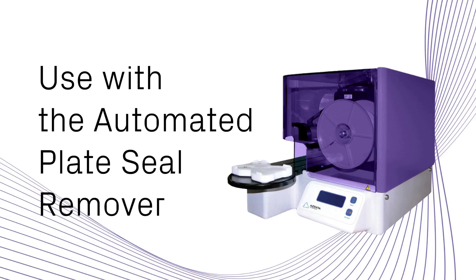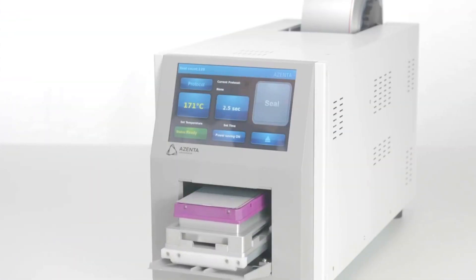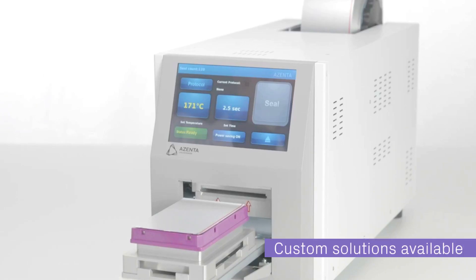The instrument also works perfectly in conjunction with the automated plate seal remover for sealing and peeling. And if you have sealing requirements that aren't met by standard sealers, we can look into design and manufacture custom solutions for you.